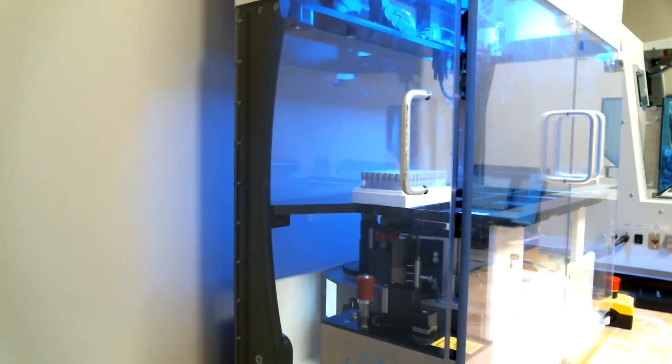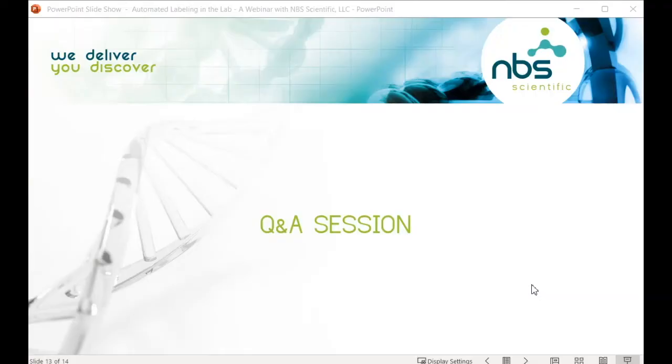So now that we're done with the live demo, I guess we can pass it over to questions if anybody has anything. Yeah, so let's take a few minutes just to allow people to drop in their questions if they have any. I guess while we let people do that, Ryan, you talked about maintenance, but can you also talk about any service contracts that are available?